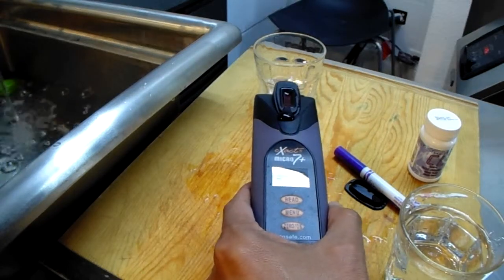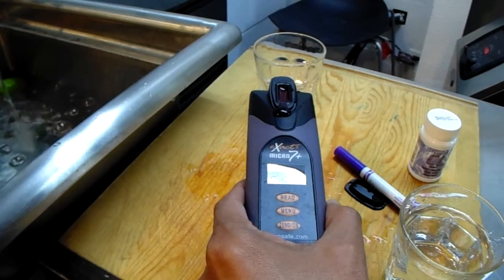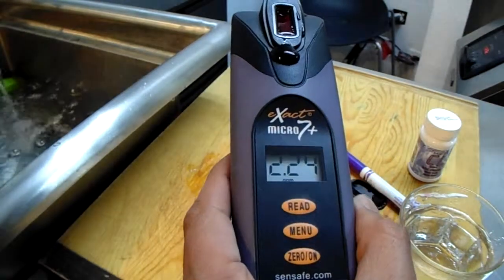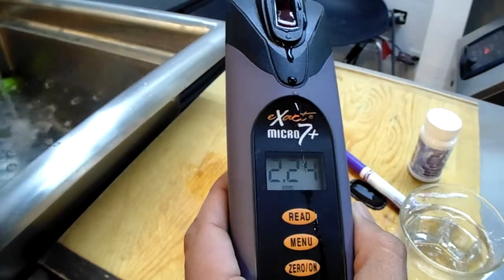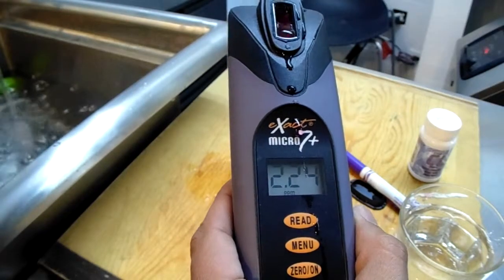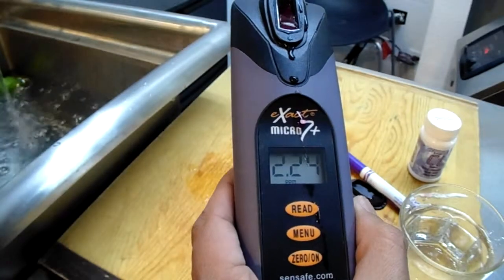So now this is going to read the ozone concentration in water, which is what you see here is 2.24 concentration of dissolved ozone at the point of use.